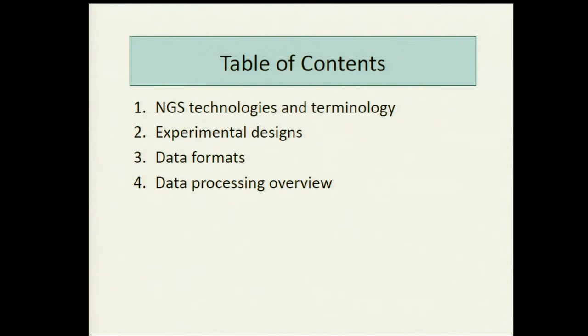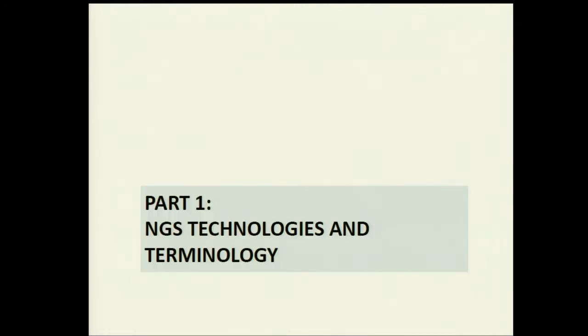OK, then we'll talk about the data formats quickly. I'll show you an example of what kind of files we use. And then a quick overview of the data processing, which Ami will then go into more details about.